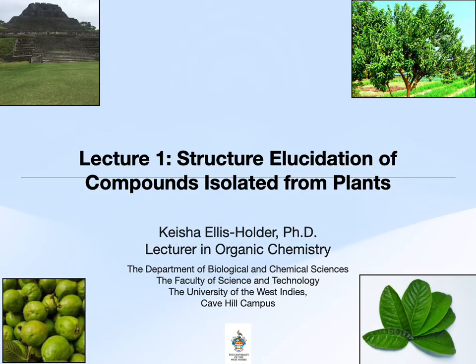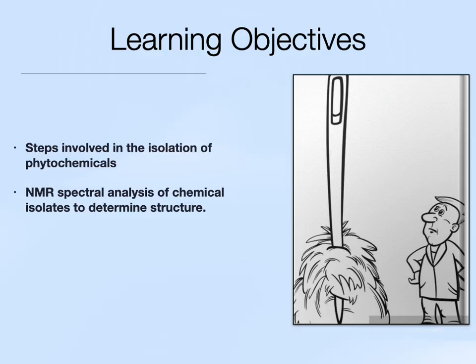Today's lecture is entitled Structure Elucidation of Compounds Isolated from Plants. The learning objectives are the following. Steps involved in the isolation of phytochemicals, and NMR spectral analysis of chemical isolates to determine their structure.